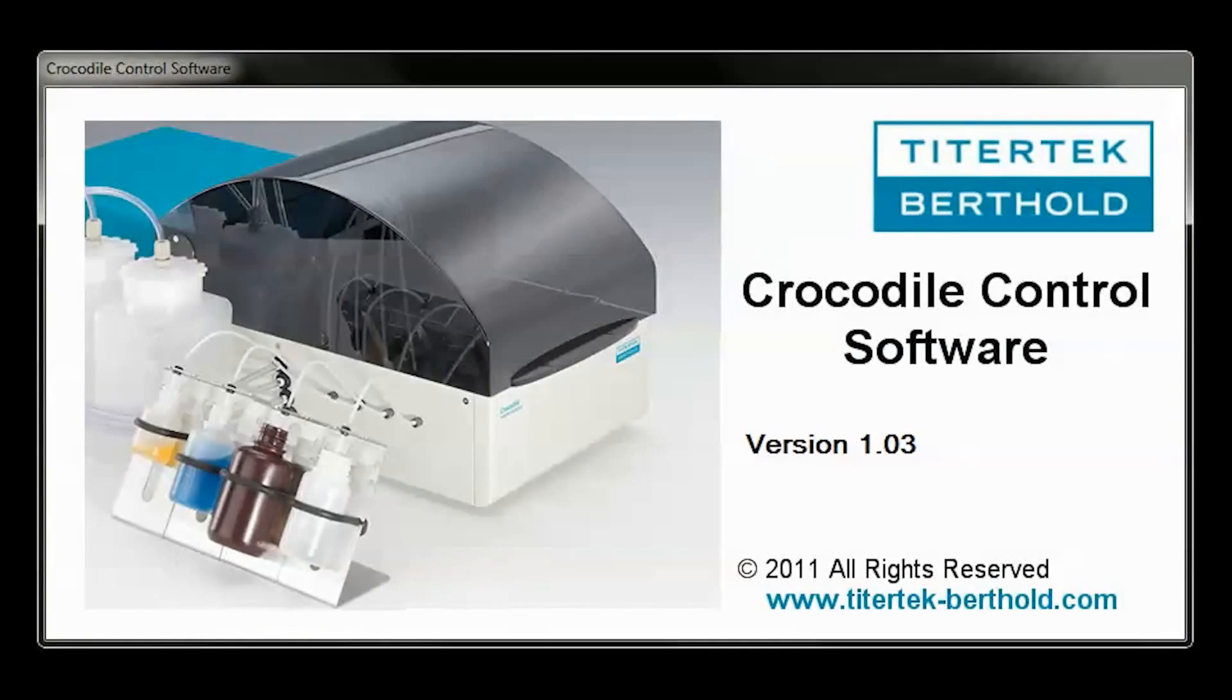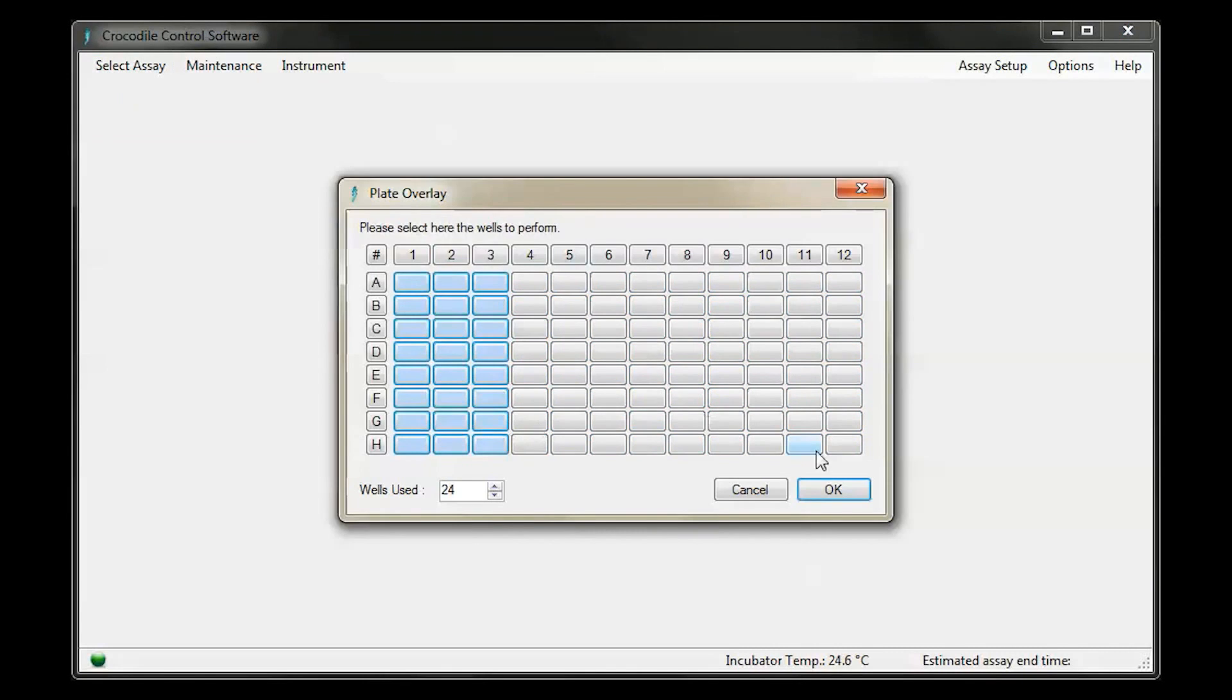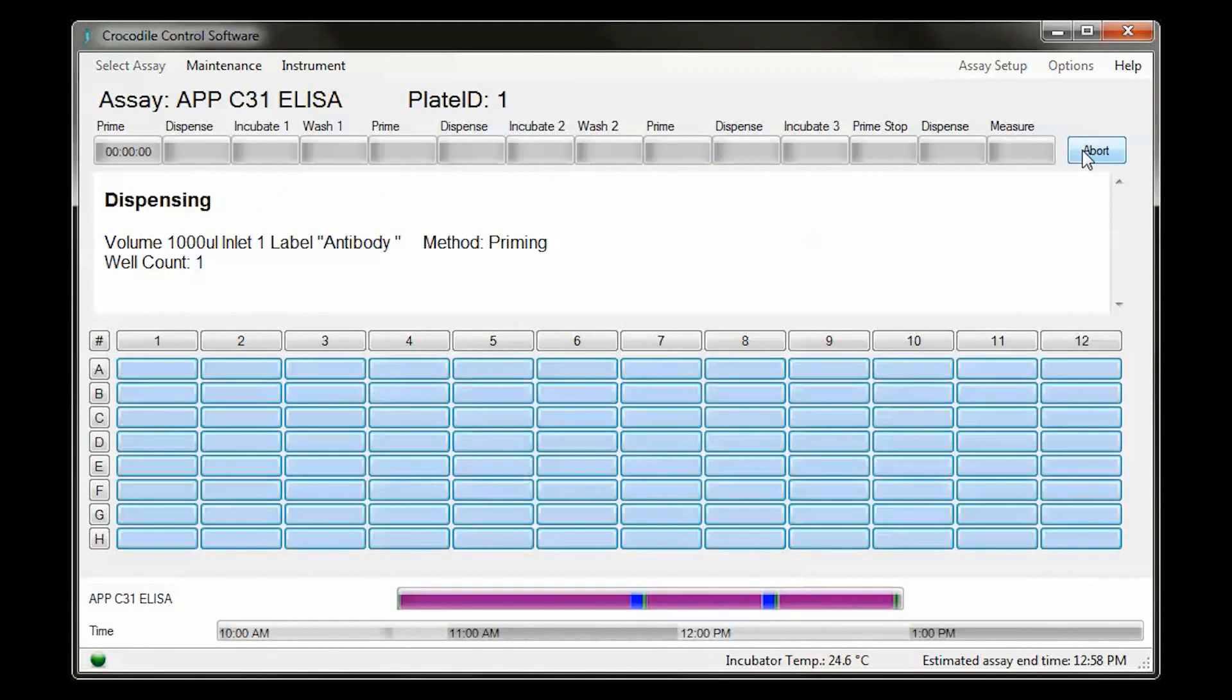Now the Crocodile Mini Workstation is ready to start. We simply load our saved assay program and click start. The Crocodile does the rest.